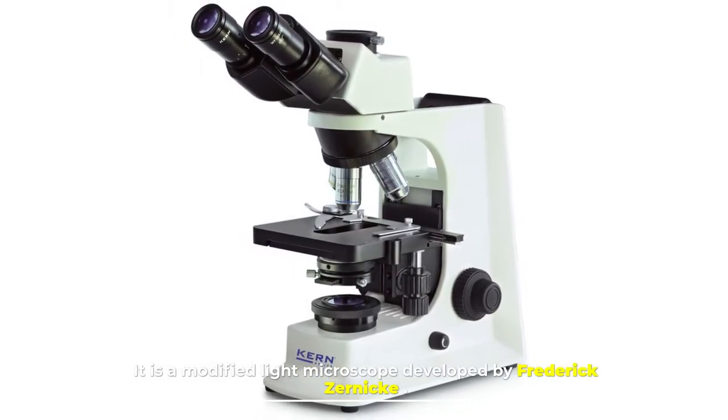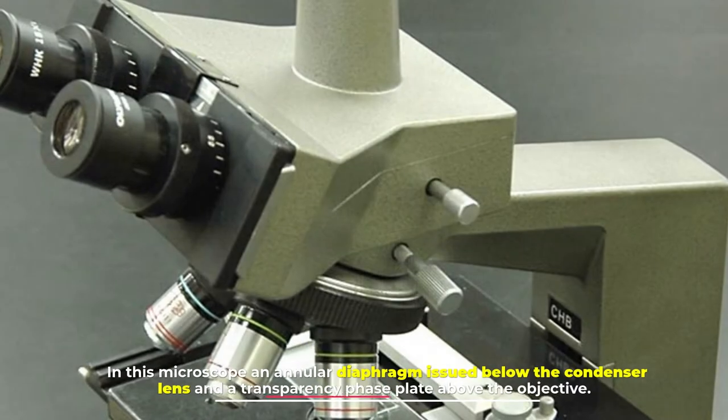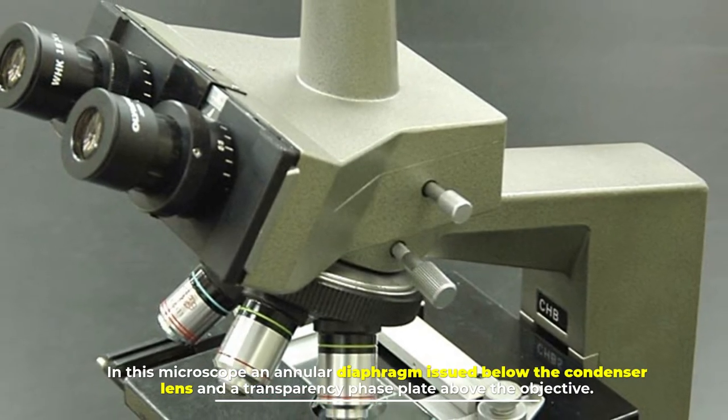Number two: phase contrast microscope. It is a modified light microscope developed by Frederick Zernike. In this microscope, an annular diaphragm is used below the condenser lens and a transparency phase plate above the objective.